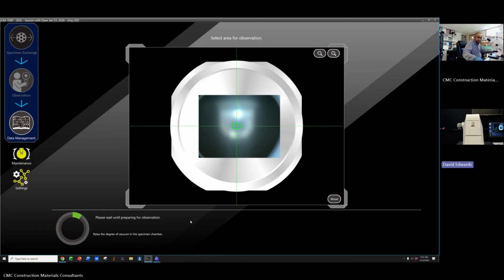I hate to say this, but I don't have a good solution for that one. I think you have to contact service. You mean the camera failed so quickly? Yeah, somehow it's not able to identify the camera.